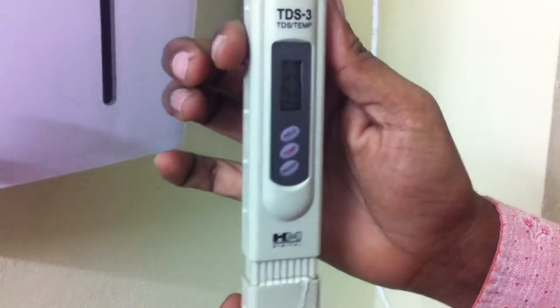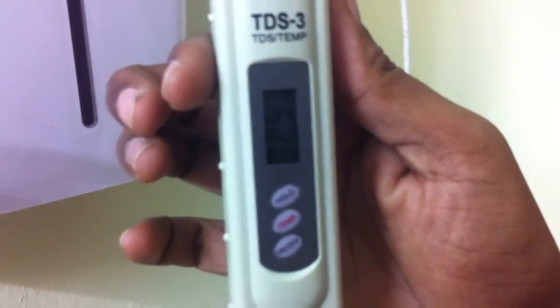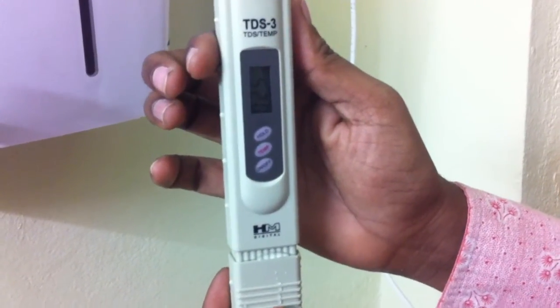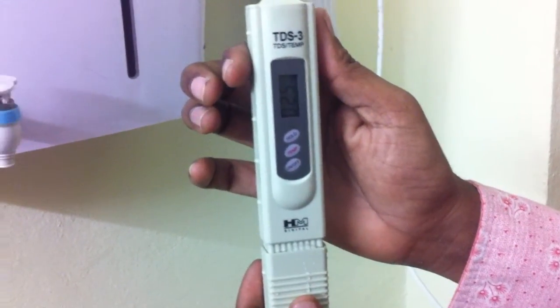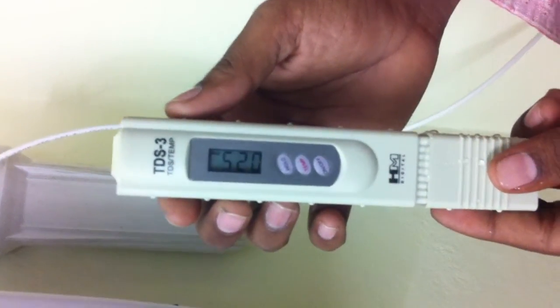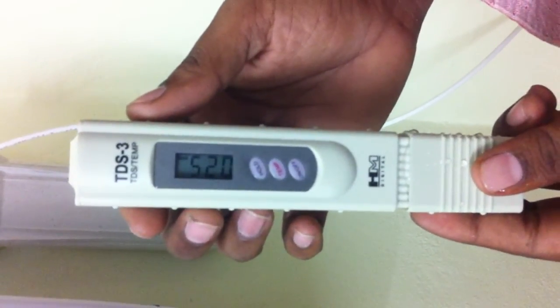Now the purified water TDS stands at 25. The raw water condition was 616 and now the water TDS has been reduced to 25, which is productive pure water — very sweet and totally pure water for healthy living. Thank you.